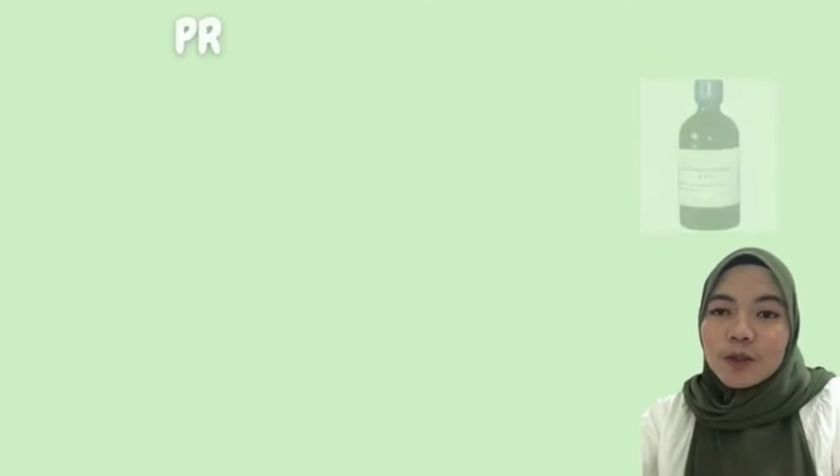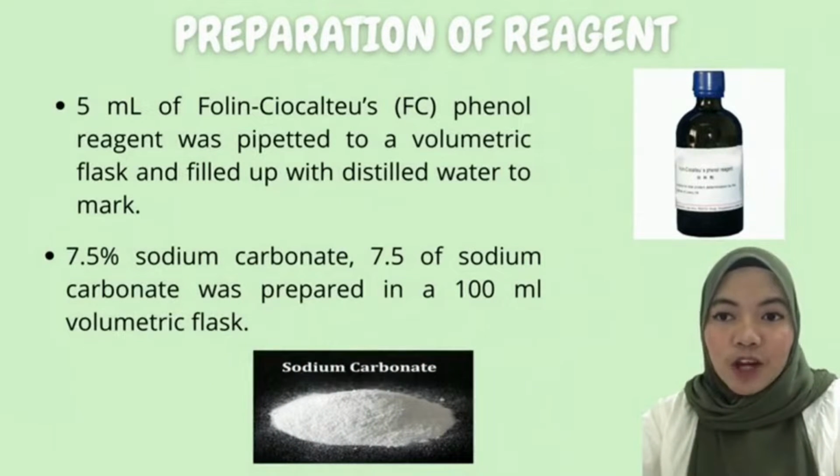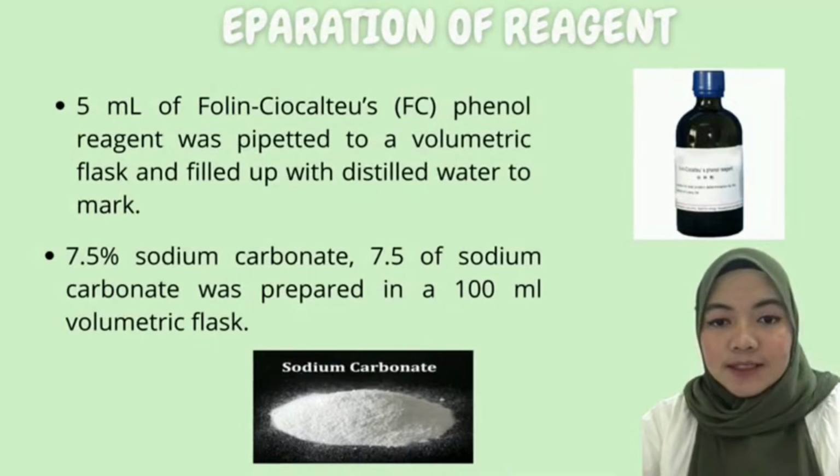So, we go to the preparation of the reagent. First, 5 ml of Folin-Ciocalteu phenol reagent was pipetted into a volumetric flask and filled up with distilled water to the mark. Second, 7.5% sodium carbonate: 7.5 grams of sodium carbonate was prepared in a 100 ml volumetric flask.